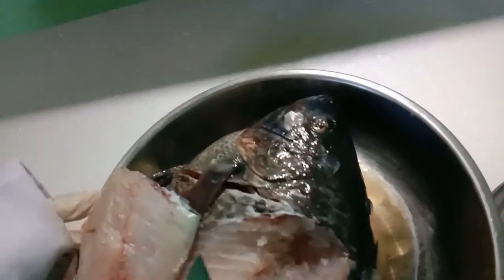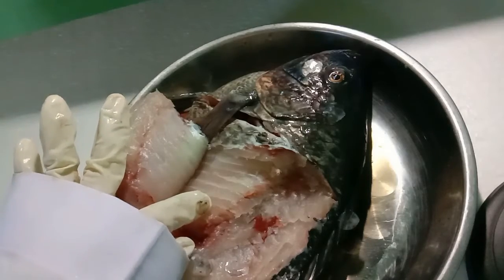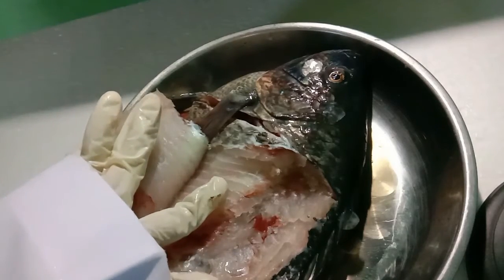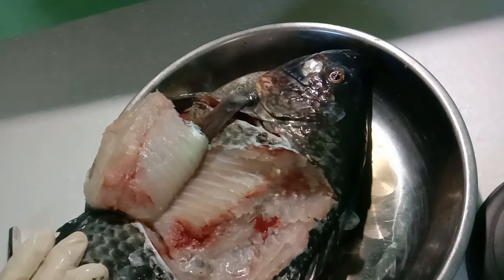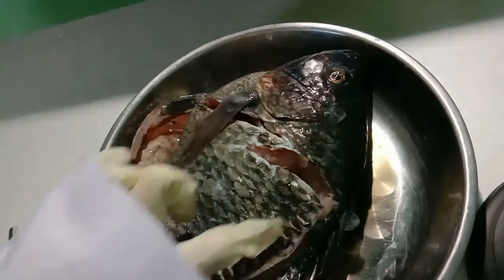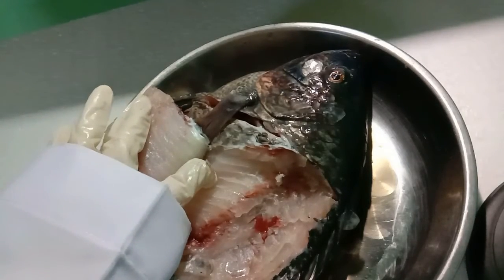Here are the muscles. You can see the line of these muscles. You can see the epaxial and hypaxial muscle here. This is the epaxial muscle in the above, and in the bottom is the hypaxial muscle.